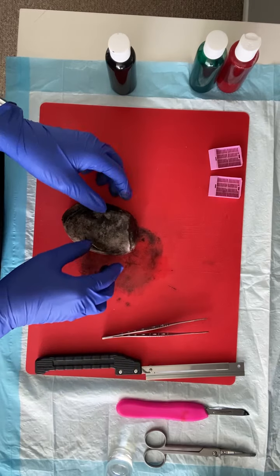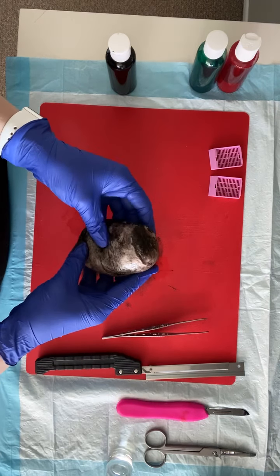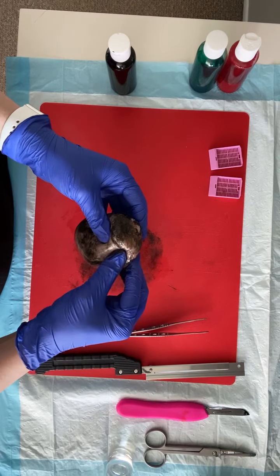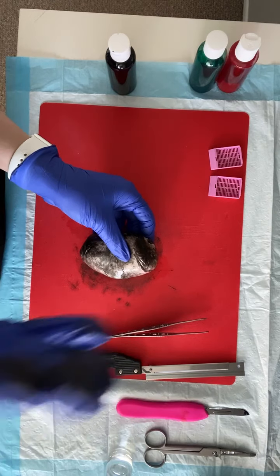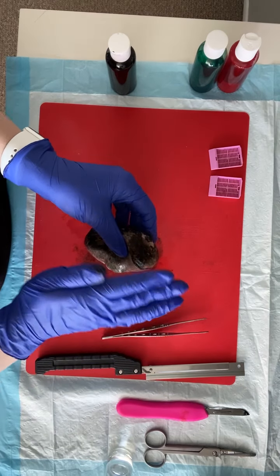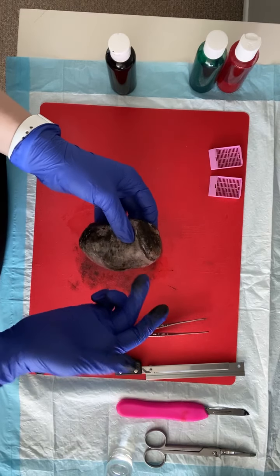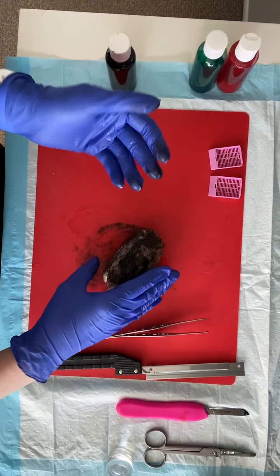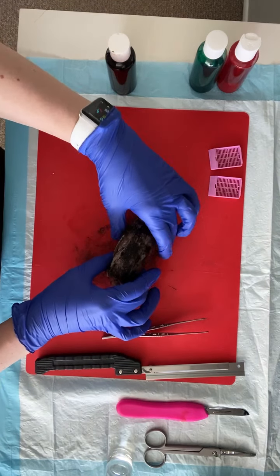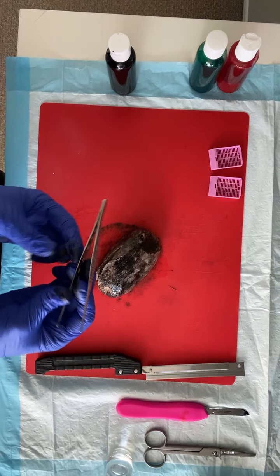After you've taken your margin, serially section through your spermatic cord to look for any satellite nodules or direct invasion. We're going to palpate to find our epididymis, because when we bivalve these specimens we want to bivalve toward the direction of the epididymis. That way, upon bivalving, when our specimen is laying open, we'll be able to see the relationship of the epididymis to our testicular parenchyma and our lesion. For this one, because we don't have that, we're just going to bivalve.